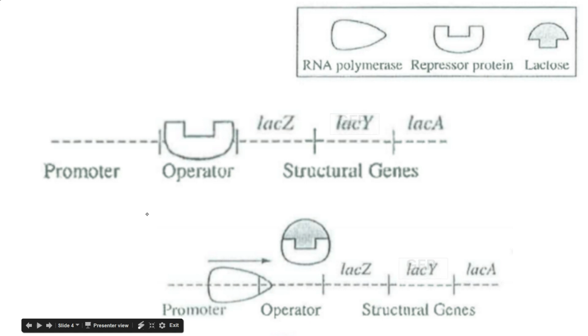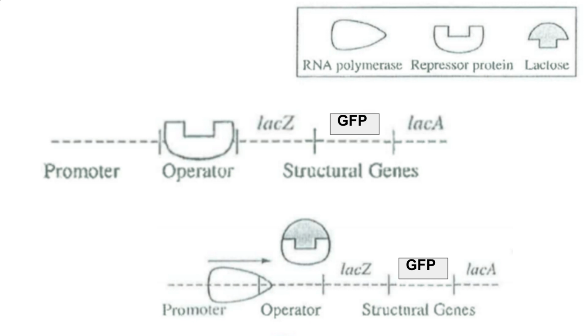It's genius. So one way of thinking about this lab is that we can genetically engineer this and put the gene for green fluorescent protein into this sequence. Then if the sugar is present, not only will it make the genes to break down the sugar, it'll also, because we've engineered it that way, end up making the proteins to make it glow.